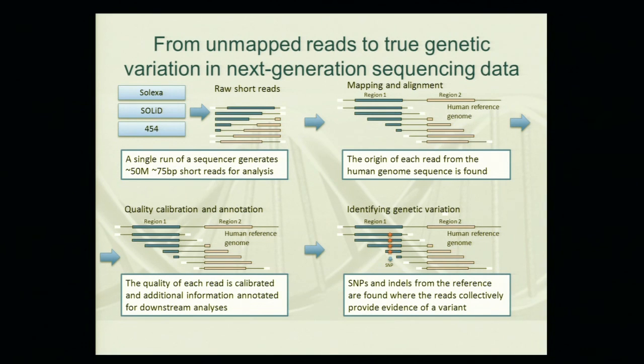But again, sequencing is a changing sphere. So I'm sure that in a year, this talk will be outdated in terms of some of the things that I tell you. But at a core level, this paradigm isn't going to change in the near future, I don't think, which is you get these raw short reads, so these strings of bases. And what do you do with them? Well, you try and align them to the human genome reference.